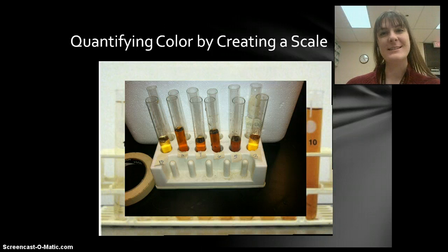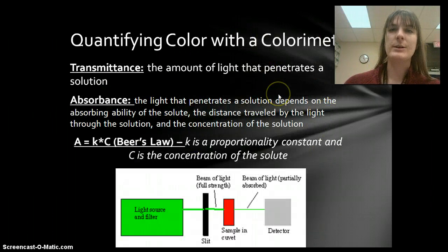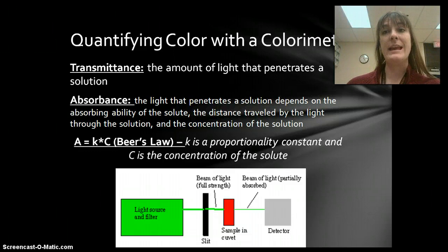Luckily, there is. We have a colorimeter. A colorimeter is a tool that we have a chance to use that works with an interface with a computer.